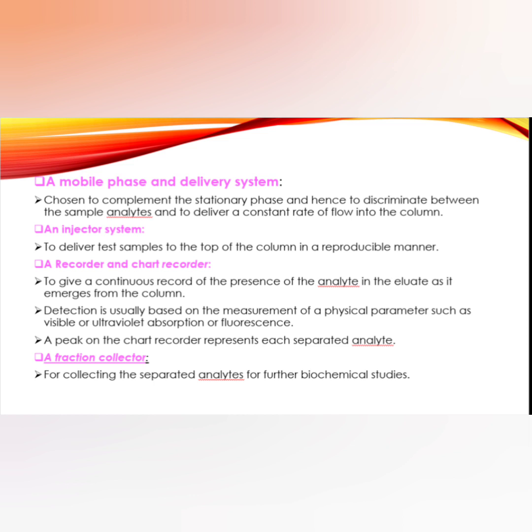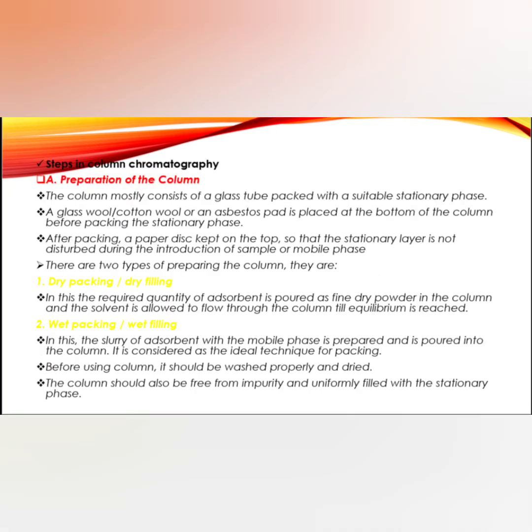A peak in the chart recorder represents each separated analyte. Next one is the fraction collector, for collecting the separated analytes for further biochemical studies. And next one is steps in column chromatography.